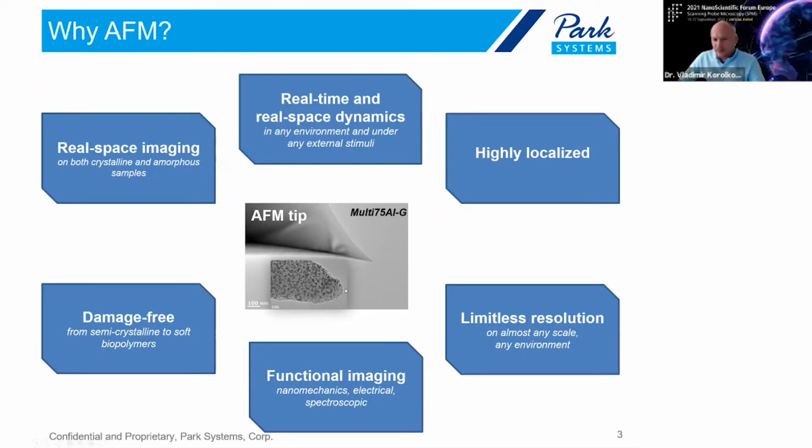The important point with that TEM image, which was taken some years ago by Michael Fay and Chris Parmenter here in Nottingham, is that when you look at the very end of the tip, you see nanostructured roughness. Despite the tip radius being around 10 nanometers, which is how the manufacturer specifies it, these little features actually help you to achieve that high resolution.